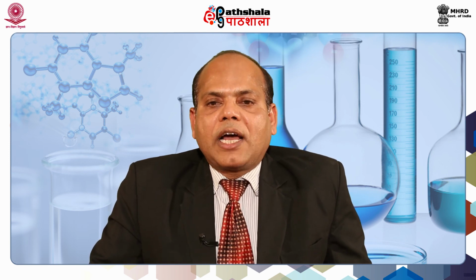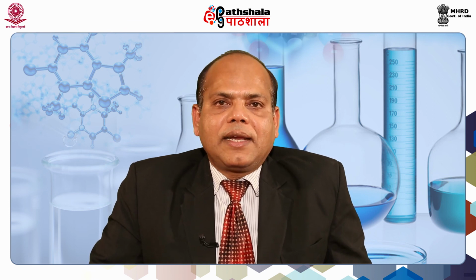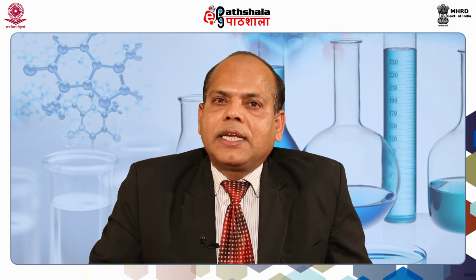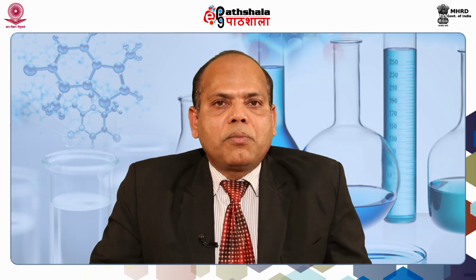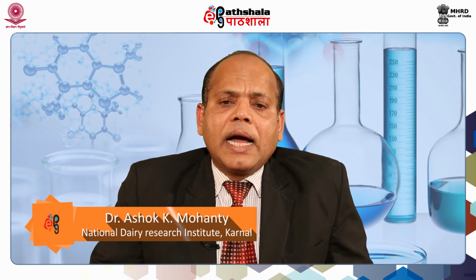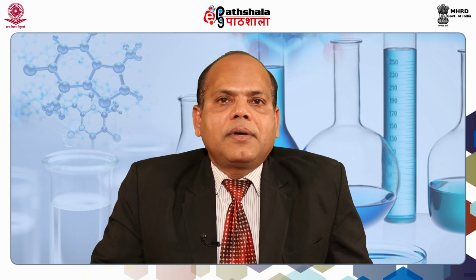If they are multiply charged, in that case what happens? There may be different spectra, but they have the same mass because they have been charged differentially. So, we have to analyze the data. When you talk of analysis of the data, what does it mean? That means first of all, we have to deconvolute all the mass spectra into monoisotopic spectra, and then subsequently those spectra have to be used for identification of the molecules.